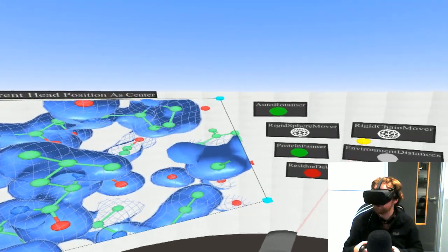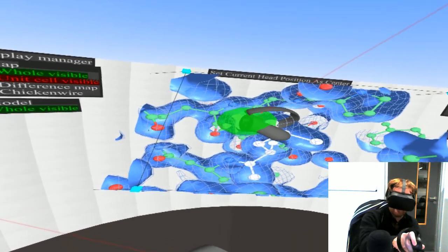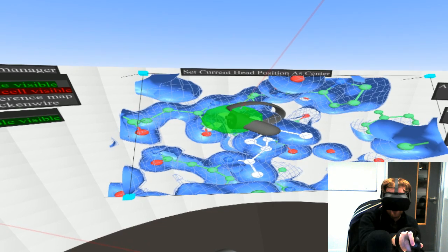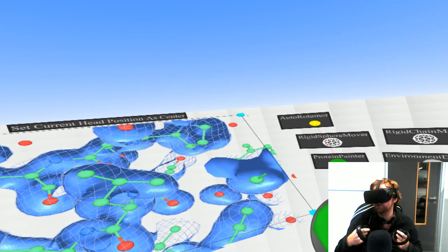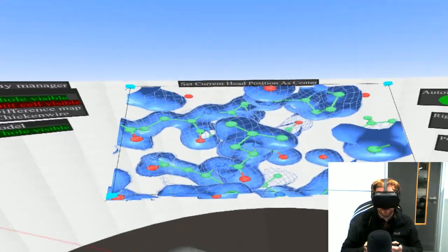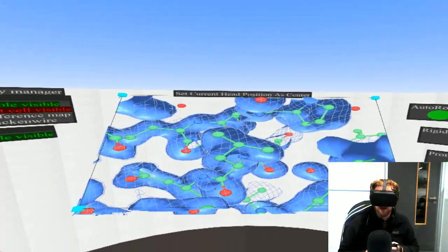Those are perfectly modelled. But one thing that you might want to do is to do this, for example. Sorry, when you don't have a speaker in front of you. See, there was a slight change in the position there. That's this tool that's running on my computer, and so it got that set of positions out of the Rotamer library.